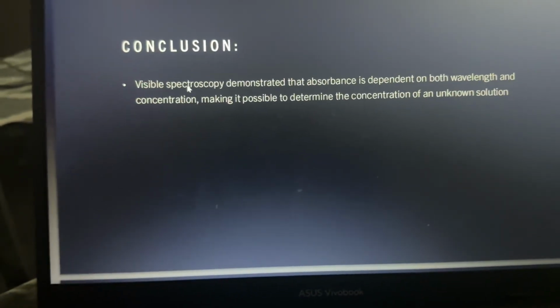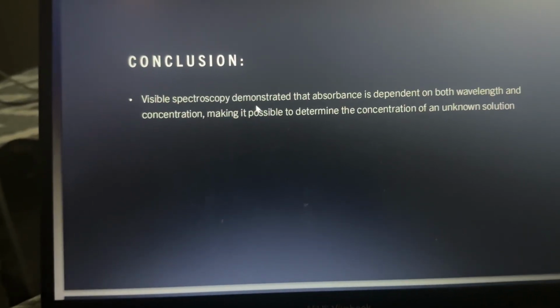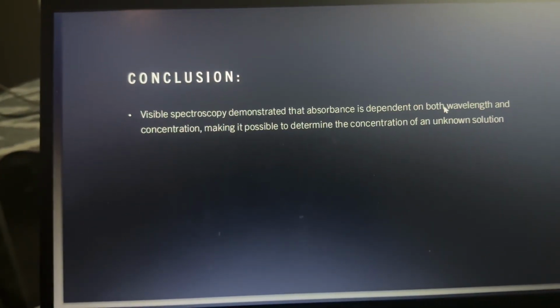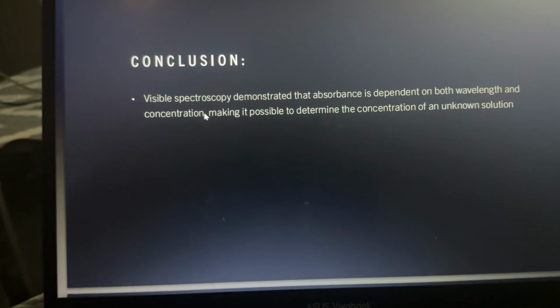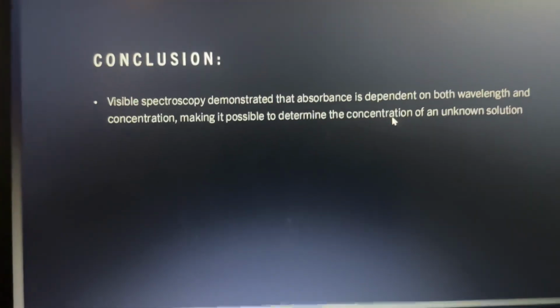Overall, what we can say from this experiment is that visible spectroscopy demonstrated that absorbance is dependent on both wavelength and concentration, making it possible to determine the concentration of an unknown solution.